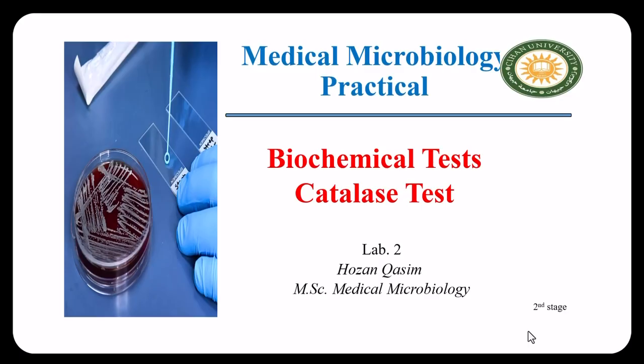of the test. In the lab, we study biochemical tests that are used to identify and differentiate between bacteria species, because each bacteria produces specific enzymes that help it survive in the environment, and by detecting this enzyme we can differentiate between bacteria species in the lab. For example, two bacteria may look the same under the microscope, but one produces the enzyme catalase while the other does not. The catalase test can help to differentiate between them.